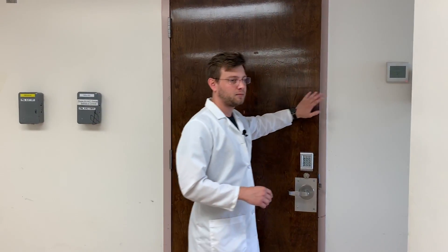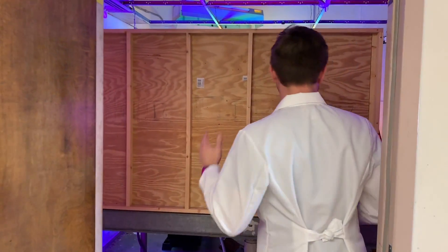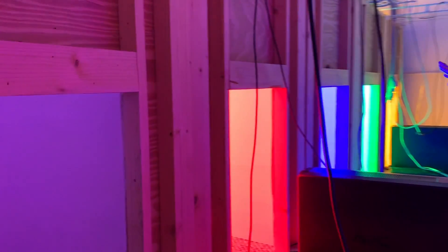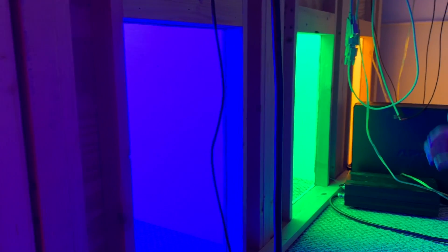Down here is our special science facility. This is where we do all of our experiments using multicolored LED lights. The first room we have set up with four different light treatments. Each box has a different colored light and we would place different flowers or different samples inside of each light box and do our treatment. We have red, blue, green, and yellow.